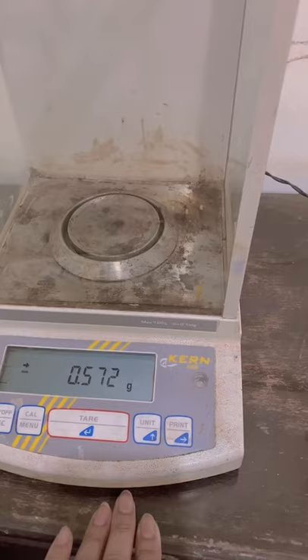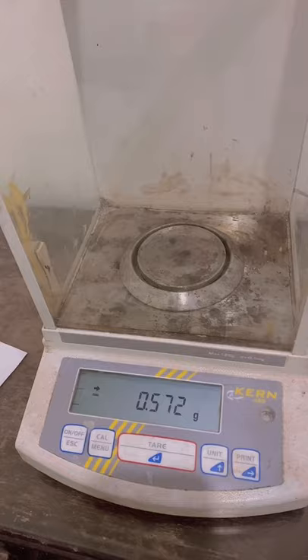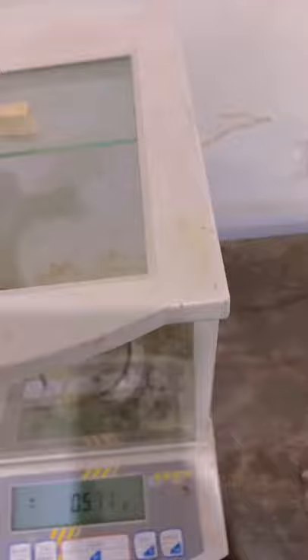You need to put it on a flat, clean surface so that it is well placed, for precise accuracy and precise measurements of minute samples. It can measure up to three digits, as you can see here. It has a weighing pan inside — small in size to accommodate smaller samples.